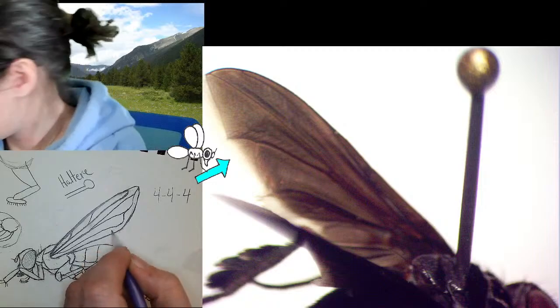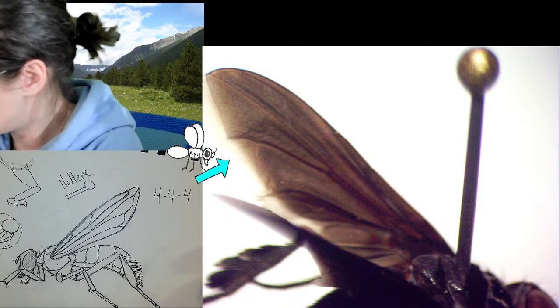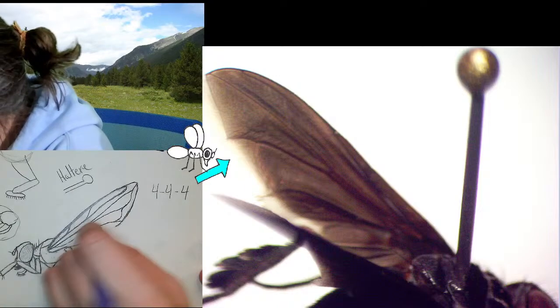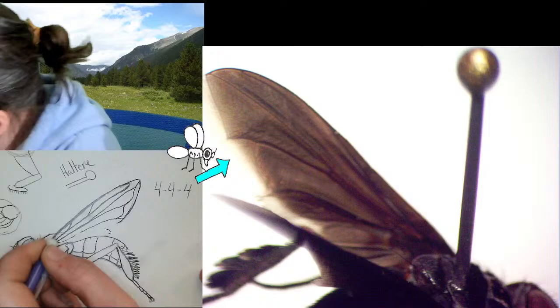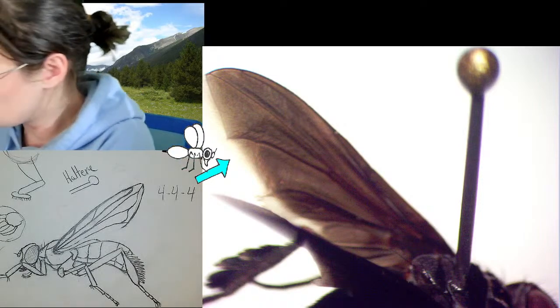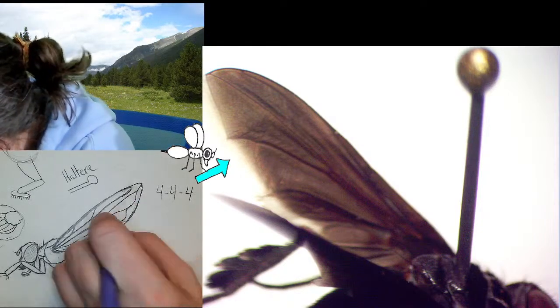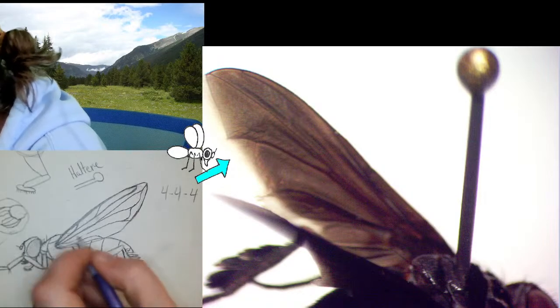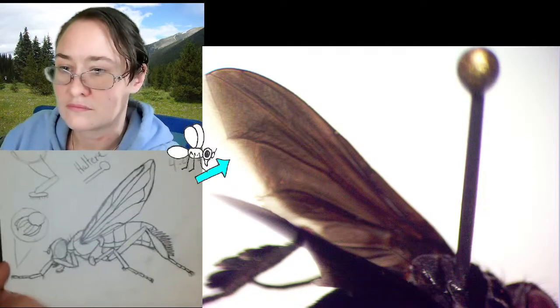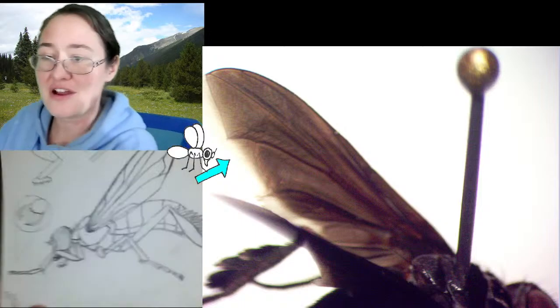Alright, then at the very bottom, this one actually does connect to the edge. And then I think that that's going to be about it. Oh, except we do get one anal vein. There is one vein. My wing is too narrow. There is one anal vein that starts down here, comes out, and then touches the bottom of the wing. So I'm going to use where the anal vein should go, and then widen my wing just a little bit. Cool. Awesome. So that is our fly.